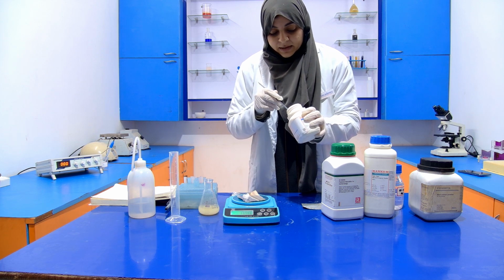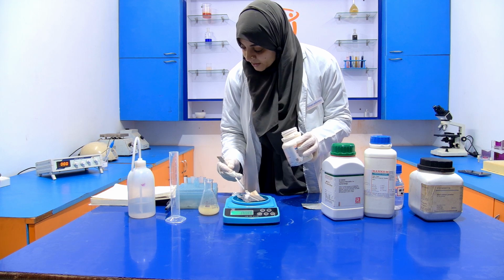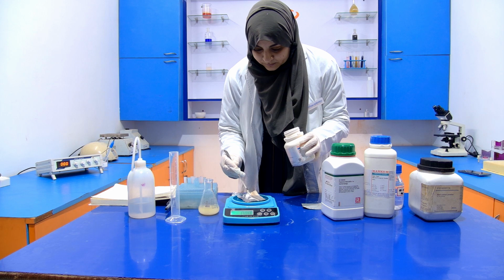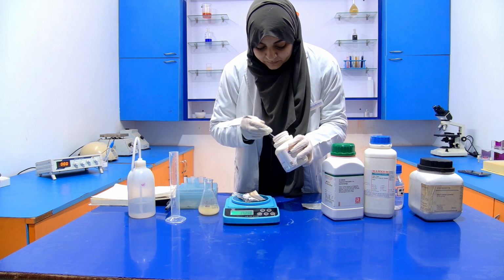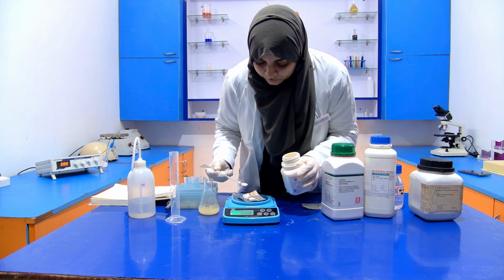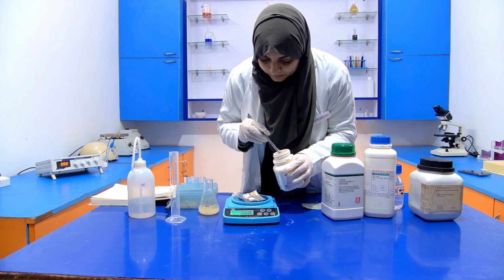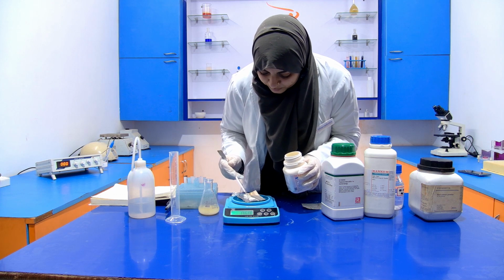After taring, we have to add NaCl, and it should be around 0.5 gram. 0.25, 0.44, it is 0.6, so we have to reduce it.